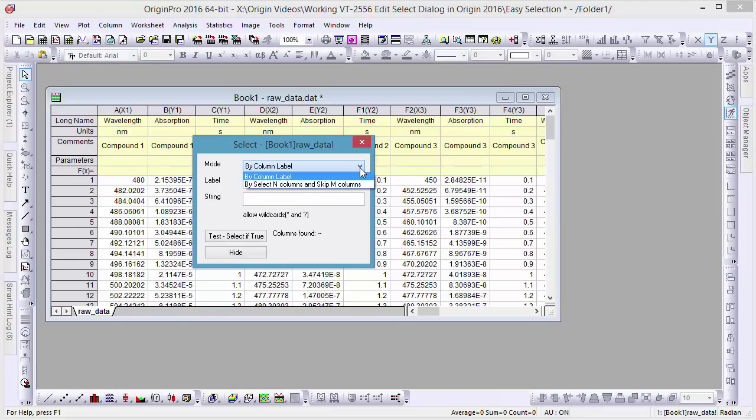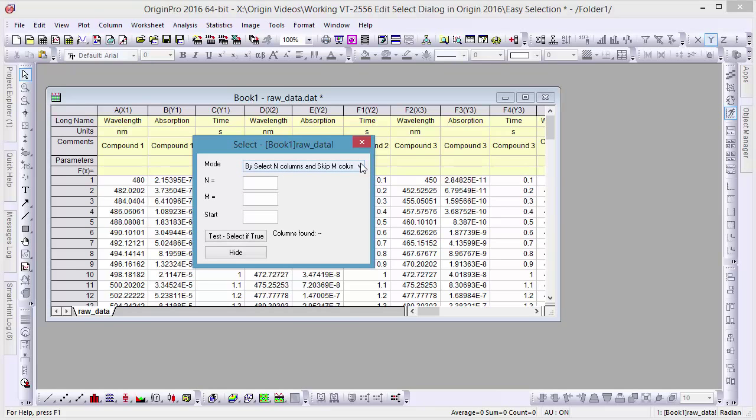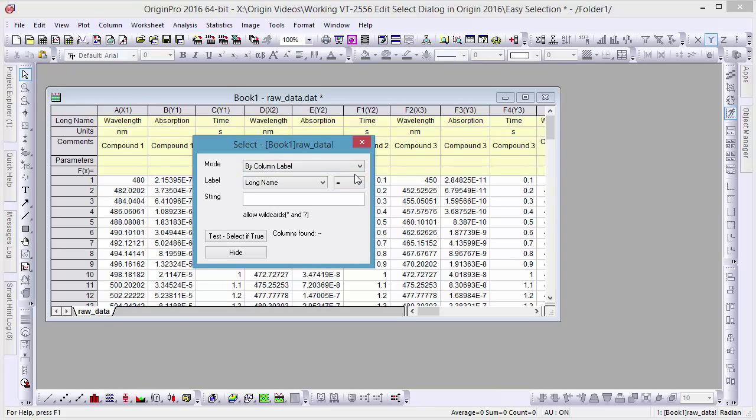This dialog has two modes, one which allows us to select by column labels, and another which allows us to select specific columns while skipping others by the column value.